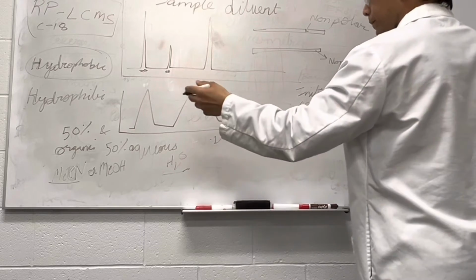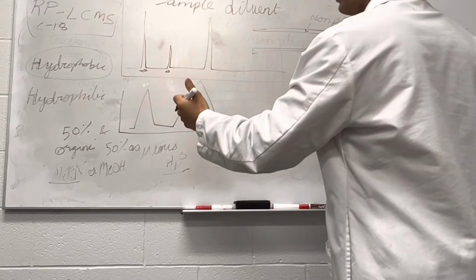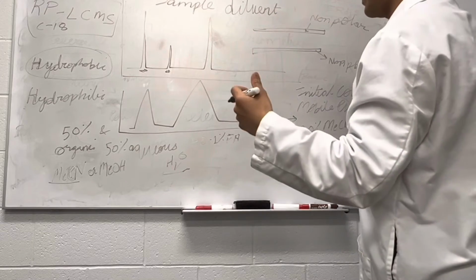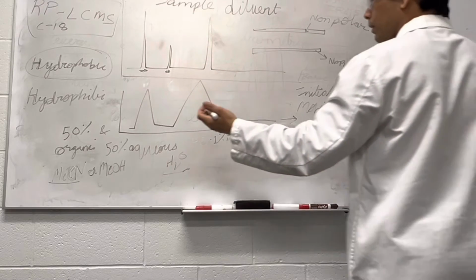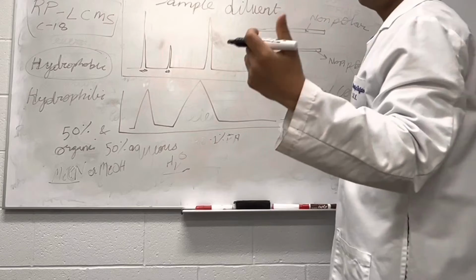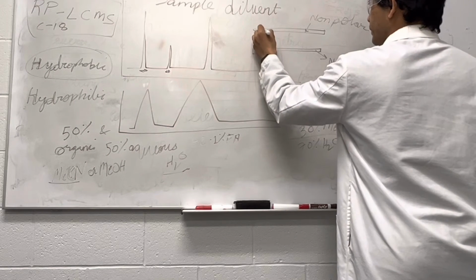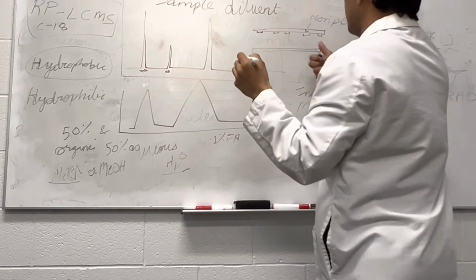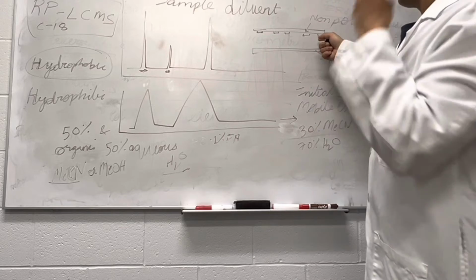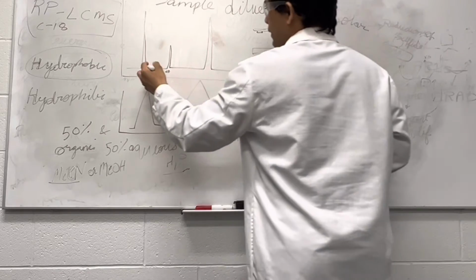because of the strength of the sample diluent, a homogeneous mixture will not be formed, as they do not get enough time to mix evenly. So our sample will get stuck at different places in the column, and our analyte will elute at different times.